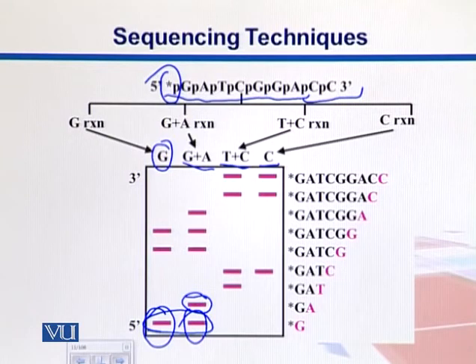So it's kind of exclusion plus double evidence kind of reactions where we can exclude one base, and if we see that we have the band in both of them, then obviously we can take one of them. So here for example in the T and C reaction we see just one band, so it's not there in C but it's there in T plus C, so for sure it's T. Here again we see two bands, one in T plus C and one in C, so we can say that for sure it's C. In the same way we can do it for the others, and in the end we can have the whole sequence captured.